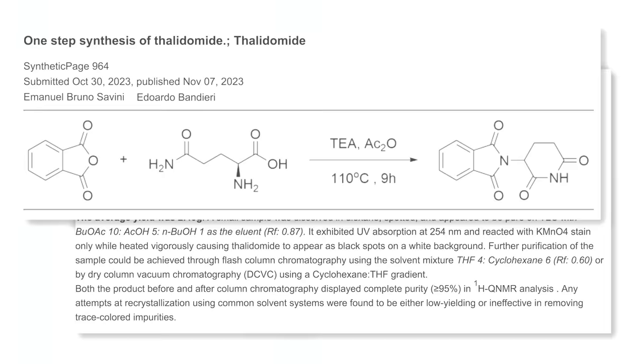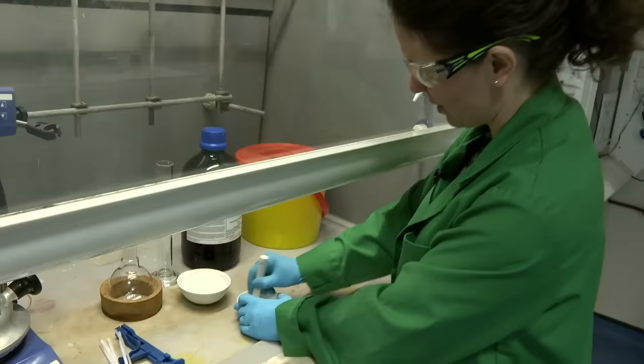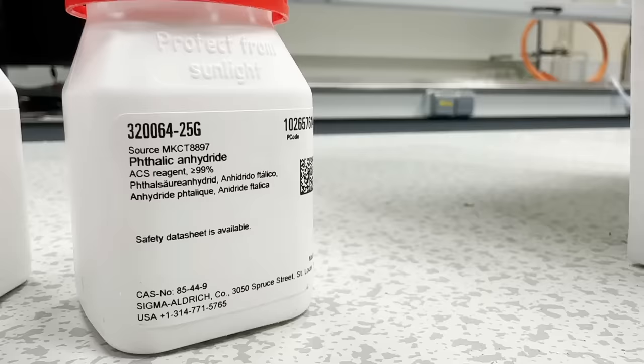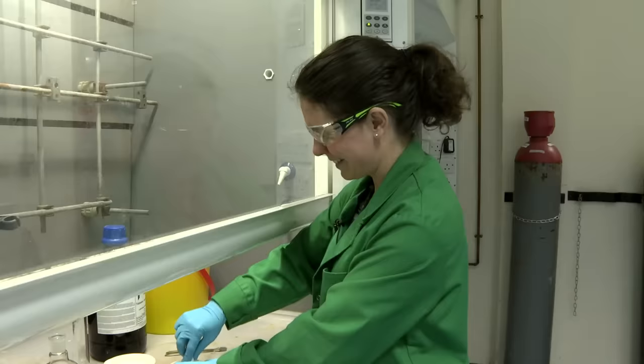And then the instructions say to pestle and mortar this for roughly two minutes. I'm assuming this helps to break down the phthalic anhydride, which is in rather large clumps here. Miriam, is a pestle and mortar common in labs these days?